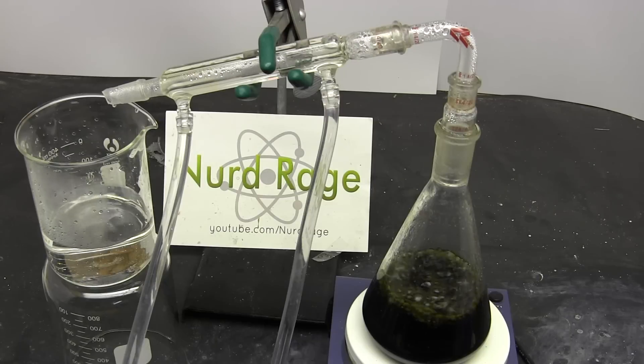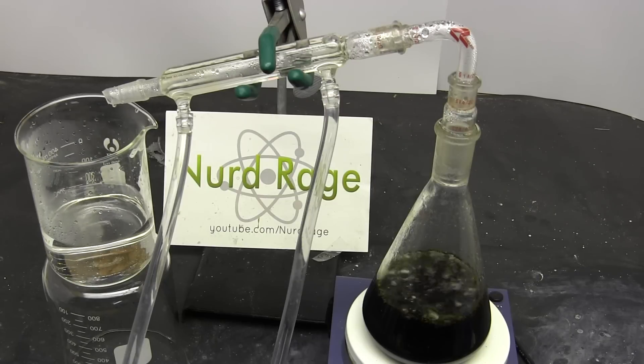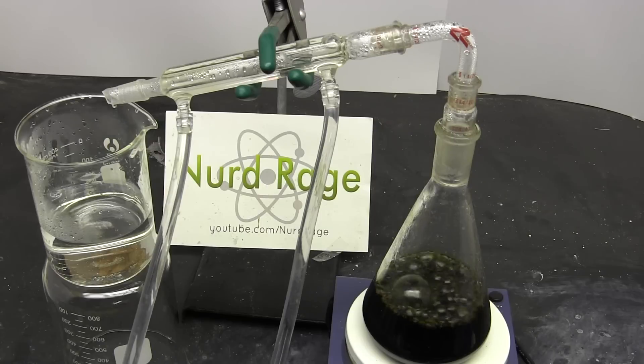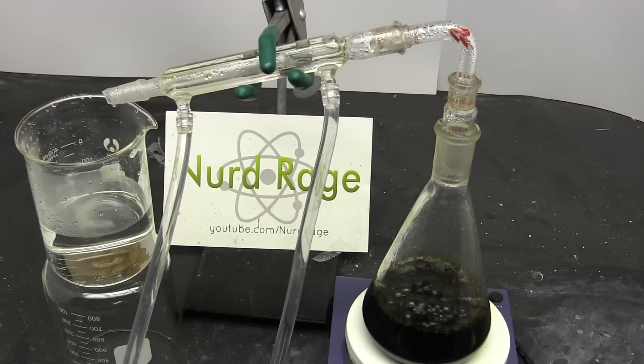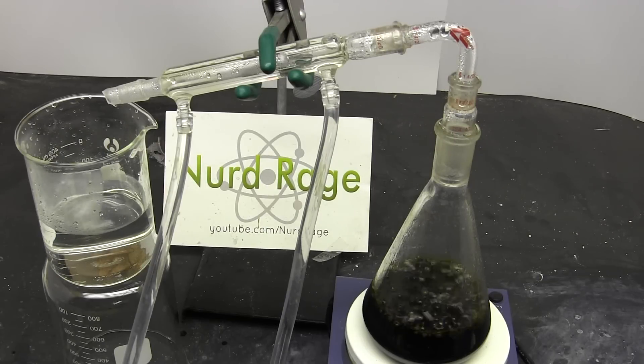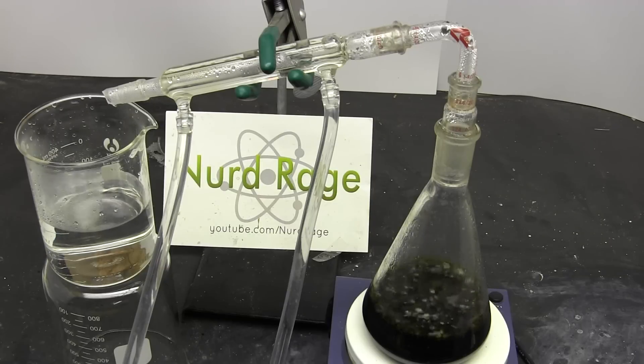My solution is a bit darker than originally because I performed this part of the video a few days after the filtration. In that time air had oxidized some of the iron 2 chloride into iron 3 chloride and some iron hydroxides. This is not a problem.